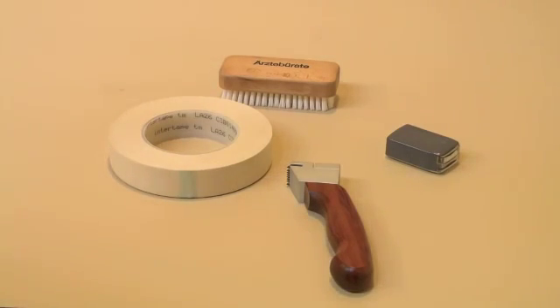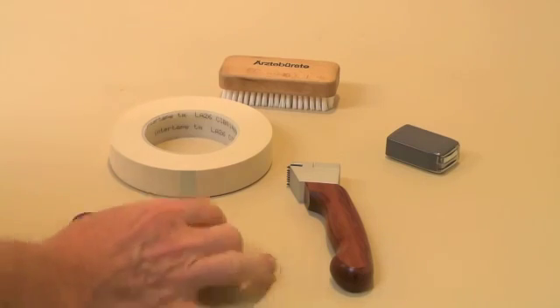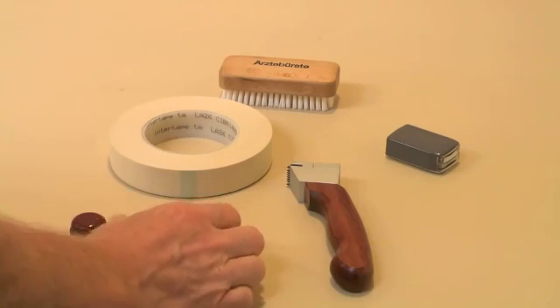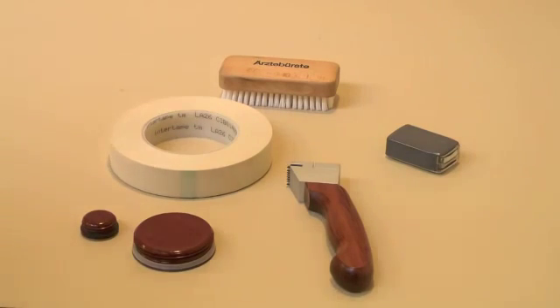The samples we'll be measuring today are drum plugs for 55-gallon drums. These are coated, and we want to determine whether the coating is adhering properly to these drum plugs, and so we're going to set up a test to measure those.